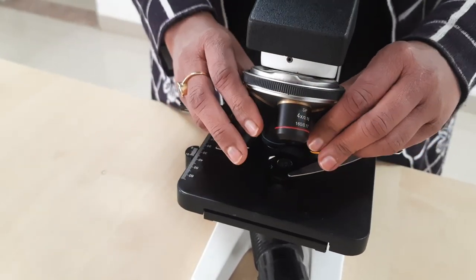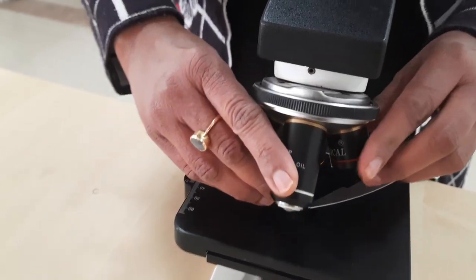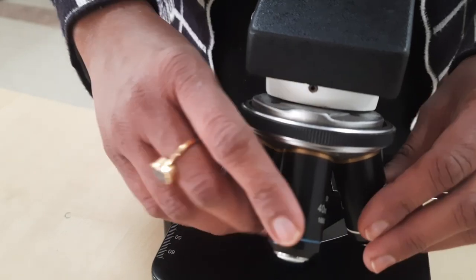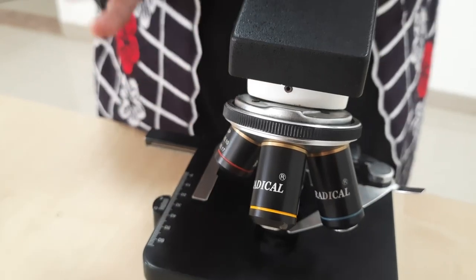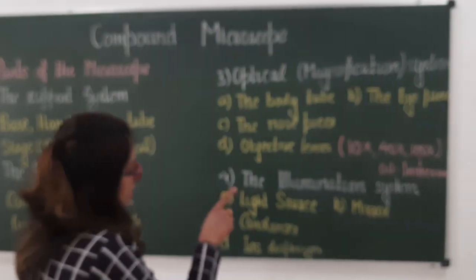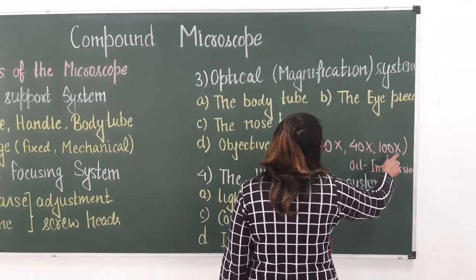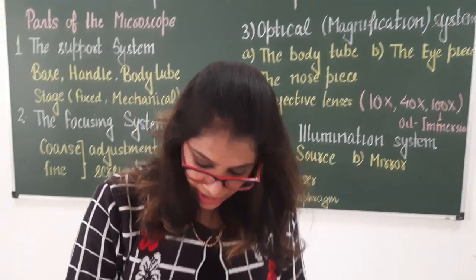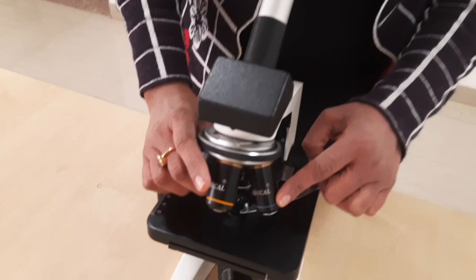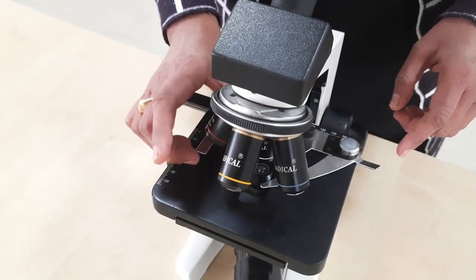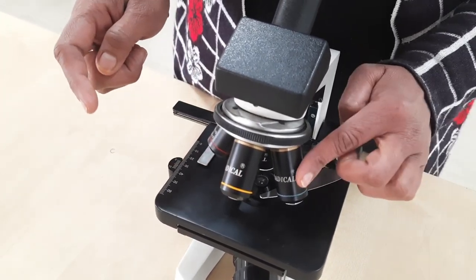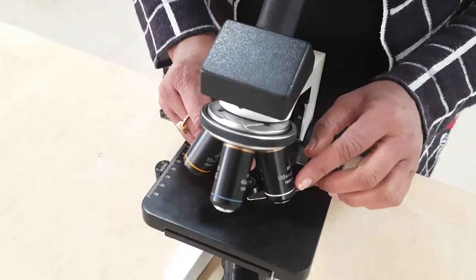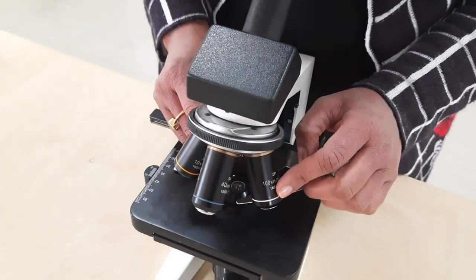Whenever we rotate the nosepiece, the objective lenses click into place — you can hear a click sound when the objective lens is properly positioned. The 10x is known as the low power lens, 40x as the high power lens, and 100x as the oil immersion lens.